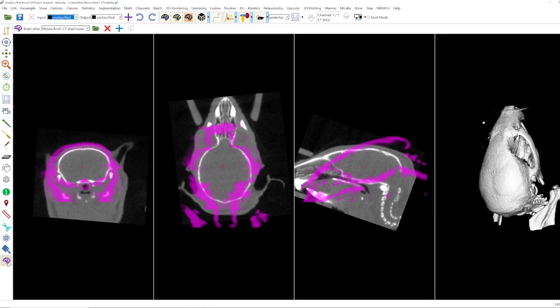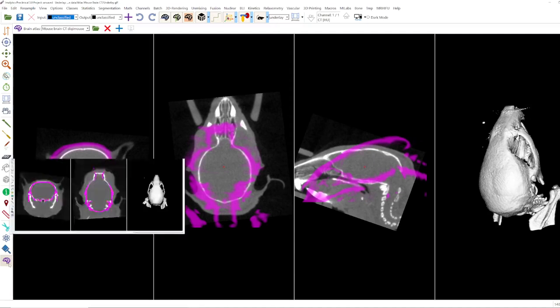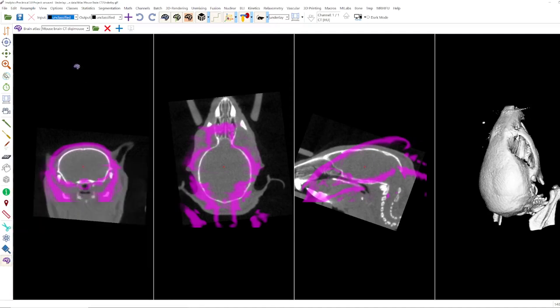When you press here you see that the pink atlas will appear. With this module you can open an atlas or select one. You can also load another one from your own atlases and then you can align it with your underlay and afterwards you can generate your brain segmentation.